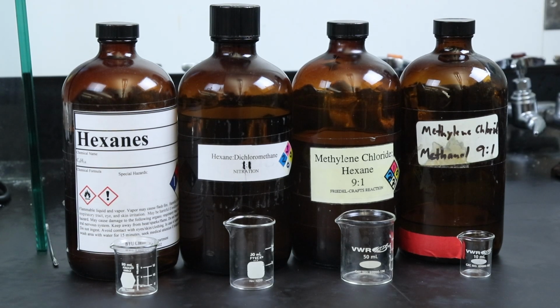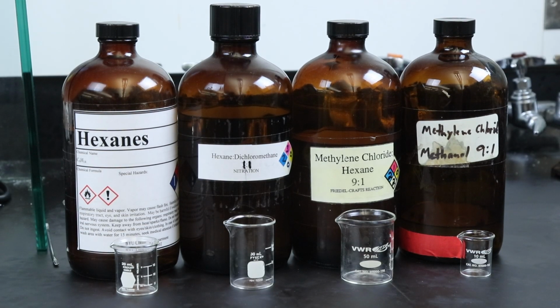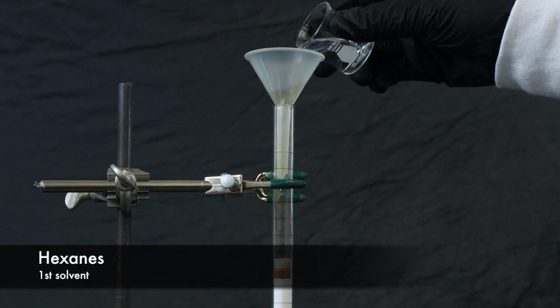Here's a look at the 4 solvents that I'll be using throughout this process and that were discussed in the lecture portion. They are increasing in polarity from left to right. So I'll be starting with the least polar, being hexanes, and I'll go ahead and add that to the column now.